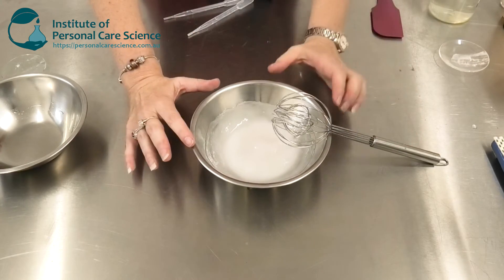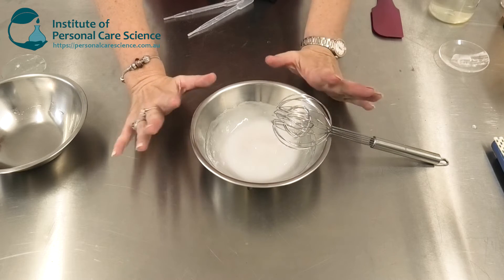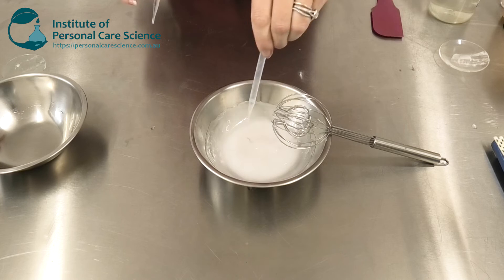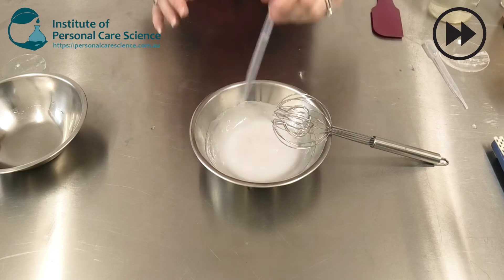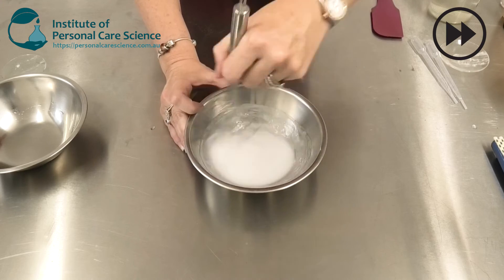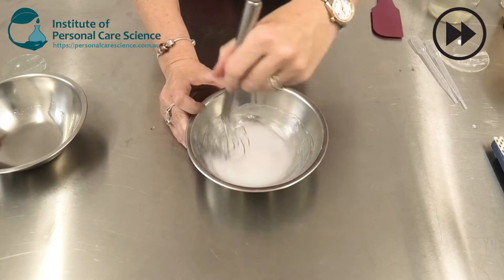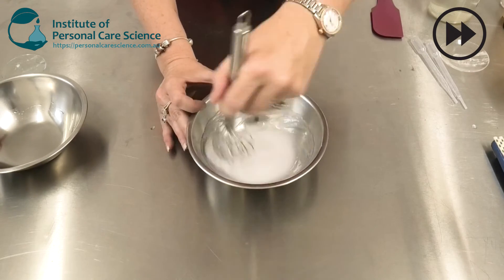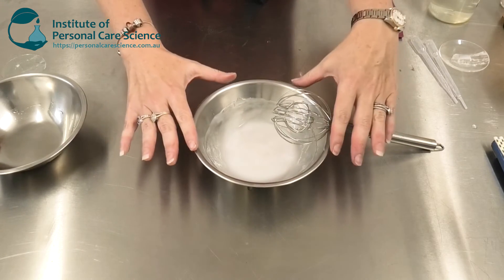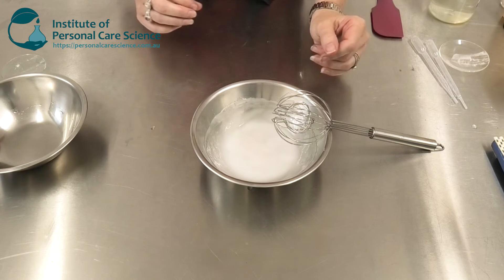As you can see, the diutin gum handles that addition really easily. Now I'm going to add my active and stir this through, and again you can see how easily the diutin gum recovers from that addition.